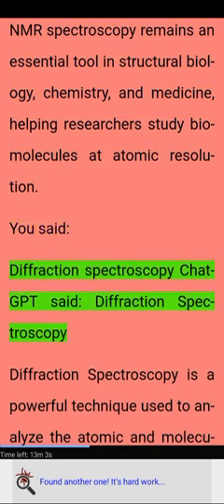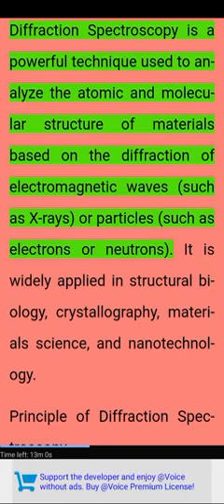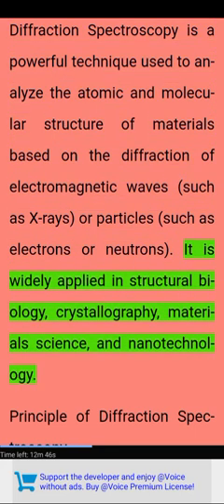Diffraction spectroscopy. Diffraction spectroscopy is a powerful technique used to analyze the atomic and molecular structure of materials based on the diffraction of electromagnetic waves, such as X-rays, or particles, such as electrons or neutrons. It is widely applied in structural biology, crystallography, materials science, and nanotechnology.